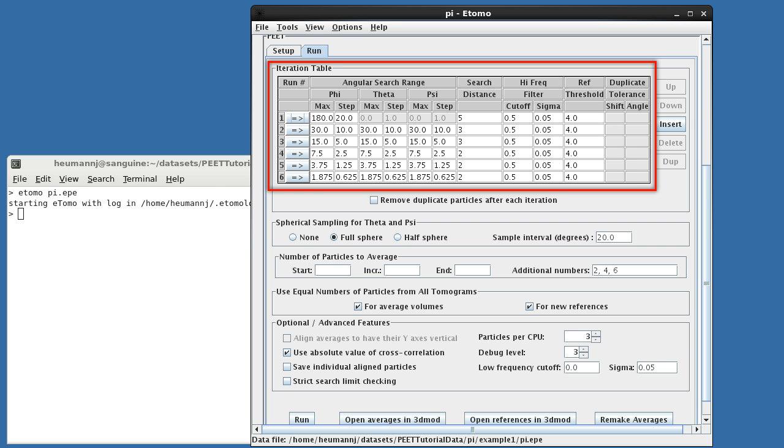This approach is preferred over a single search using a large number of very fine angular steps for two reasons. First, it requires far fewer search steps, and as a result, executes much more quickly. Second, the original reference will often be a single particle, and may suffer from noise and missing tomographic data. Generating new references as the alignment proceeds minimizes these difficulties, allowing the reference to improve incrementally.